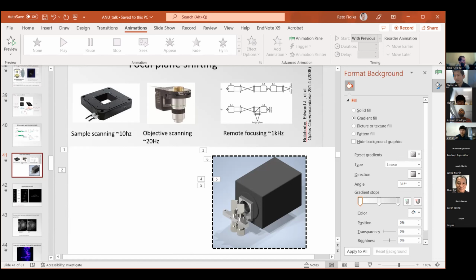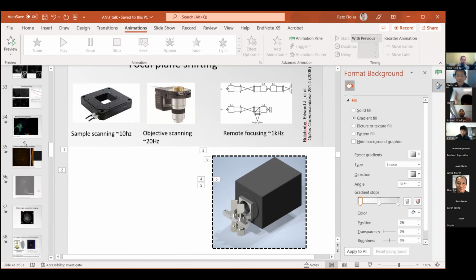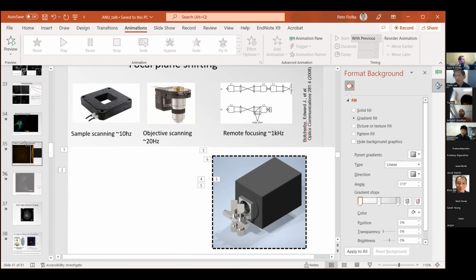I think the question will become more, which of the two galvos is more sluggish? And I actually would suspect that these are a bit more sluggish because these need to span the field of view. So these are usually 10 millimeter or 50 millimeter galvos, whereas the galvo in the OPM is like 5 millimeters. So I would guess the OPM galvo could always have a bit wider bandwidth. So my ad hoc answer would be that as long as you somehow get the positional signal of the galvos and use that to run the OPM galvo with the same waveform, maybe you get away with that non-linearity.